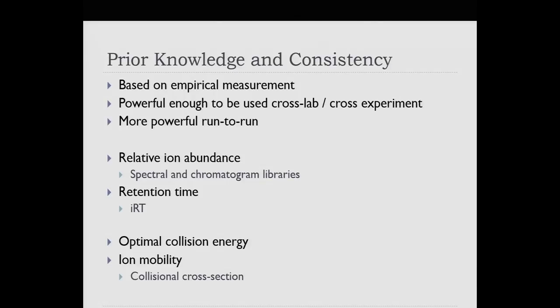And then retention time. Retention time, again, is very stable, and iRT is this concept that we can measure retention times on an instrument and store them relative to each other, and then pull them out and use them on another instrument with a different gradient.